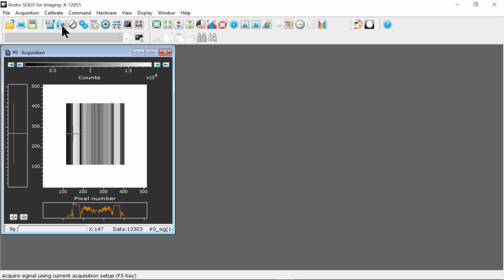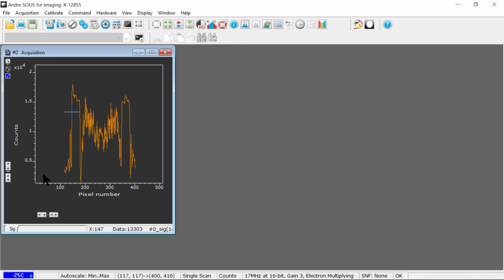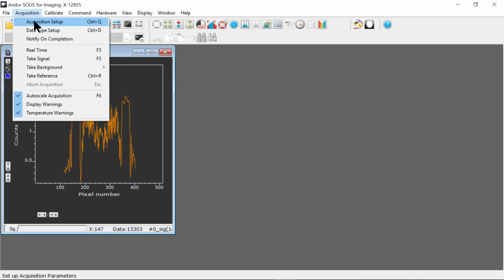And again, it looks like a barcode because I'm just doing 300 pixels across this way. If I want to view it in a more appropriate format, I'm going to go to 2D, and I have my ROI as basically a spectrum. If you're doing a spectral measurement, this will mean a lot more than it does now. Right now, we're just looking at the intensity of that image in my test rig here, viewed as a 2D slice, summed across the vertical direction. So let's go back. I hope that made it clear. If you have questions, again, feel free to send me an email at a.wise@andor.com.